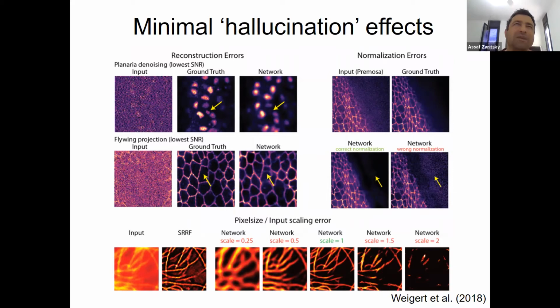I meant, if for example you want to look at some specific region out of this image, you can crop a few images out of it and run it a few times into the model with different perspectives, and maybe you will get different errors. Oh, I see. So what you mean is if we want to look here, then we can take this image and then we can take this image.